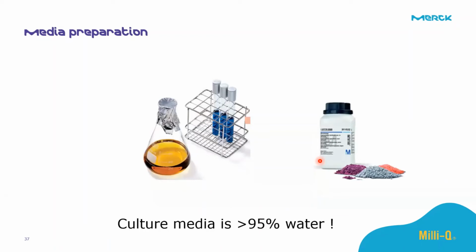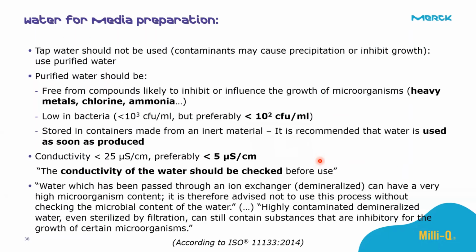So really very, very important. And to mention, tap water should not be used. Purified water used for media preparation should be free of compounds likely to inhibit or influence the growth of microorganisms, like heavy metals, chlorine or ammonia.